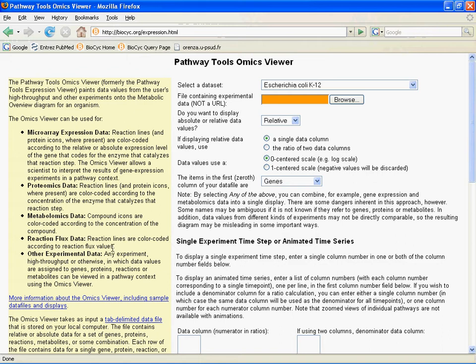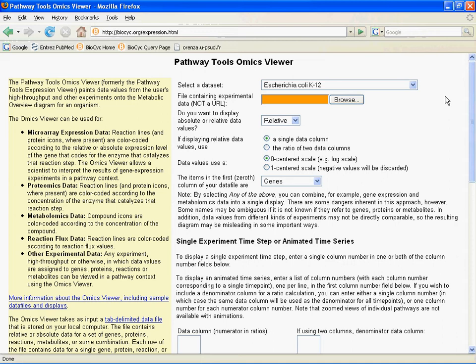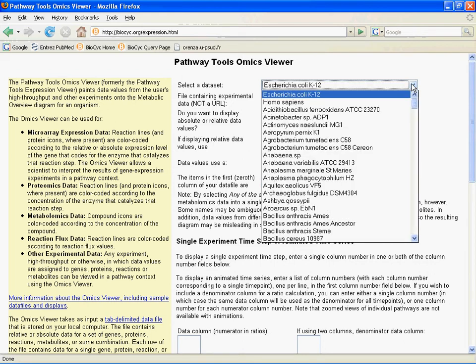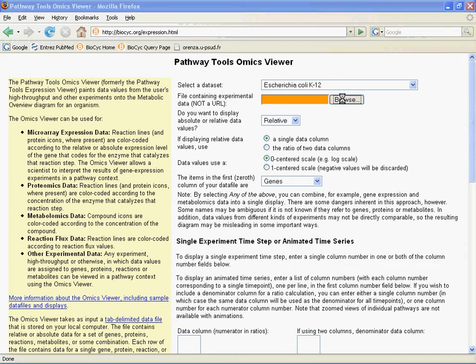On the left, we're reminded what it can be used for. We have additional links including sample data files and displays. Going from top to bottom on the page: at the very top, we have a drop-down menu to select a dataset. I have access to all the Tier 1, 2, and 3 databases in the biocyc collection. We're going to stick with E. coli because we're looking at an E. coli dataset. Then we have an entry point asking for a file containing experimental data — not a URL, but a tab-delimited text file on your desktop, uploaded just like you'd upload something to a Gmail or Yahoo Mail account.